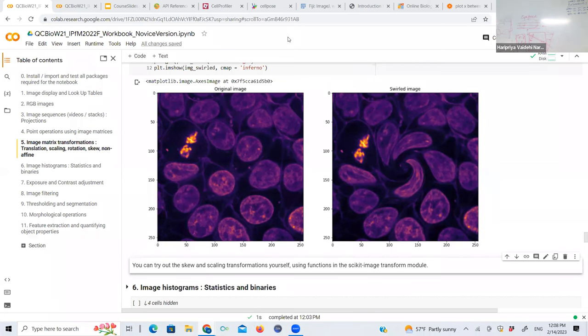Sure. There was a step where we went from an 8-bit to a float, just that made it fast indeed. And so does the order of operations matter, like whether it happens afterwards or before I turn it into a float? Because then if you bin first, you're not going to get the same result.